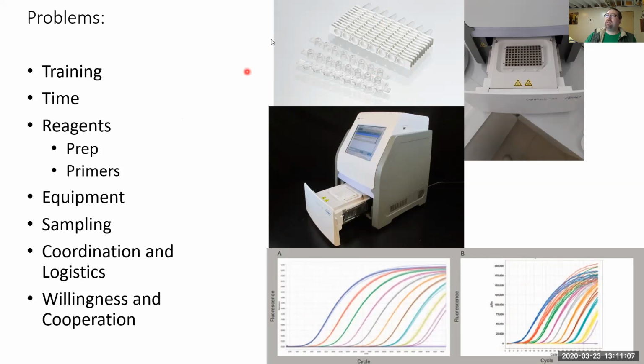changing heat source. It's all by hot air. It's basically a convection oven, if somebody bakes around here, which I do.